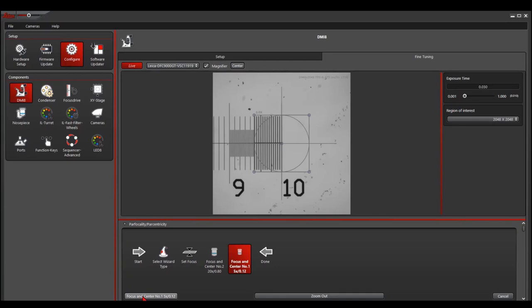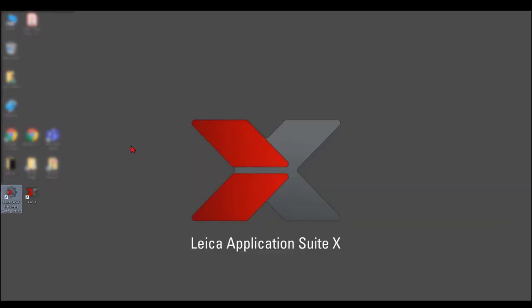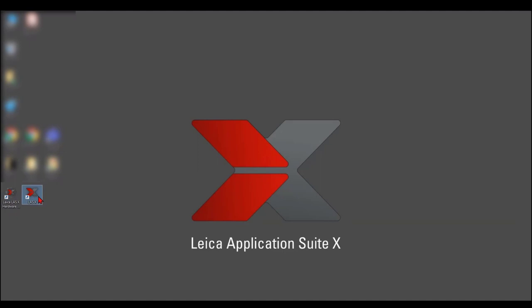Focus and center. Then click the button, focus and center, until it finishes all the lenses. Then click done, then close the software. Run the Leica LSX software again.